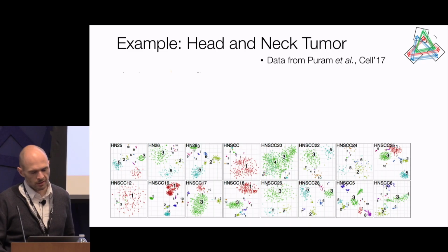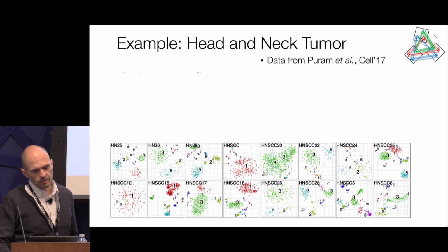Now, once you have this kind of integrated view and integrated clustering, you can start doing all kinds of analysis. So for instance, here, just looking at compositional shift between benign controls and the cancer controls. You have, let's say, benign controls with much higher B cell generation. You could start looking at transcriptional shifts within populations and so forth. All right, so I'll go over and show some examples of increasing complexity, down to almost ridiculous ones. So first, a simple one.